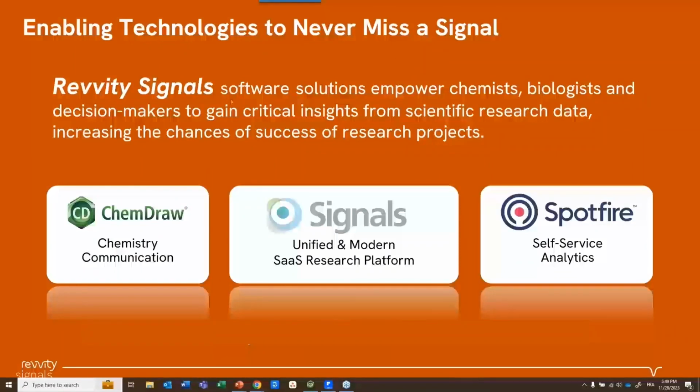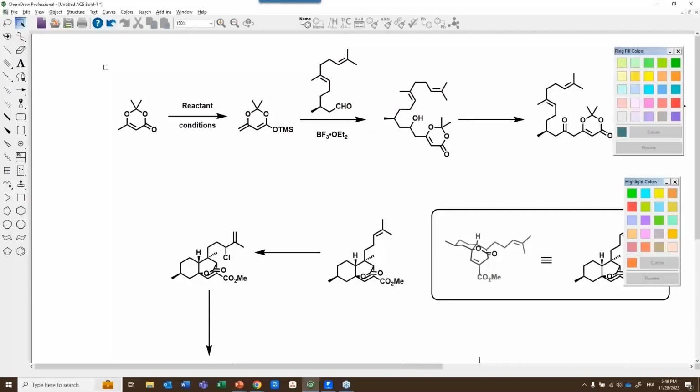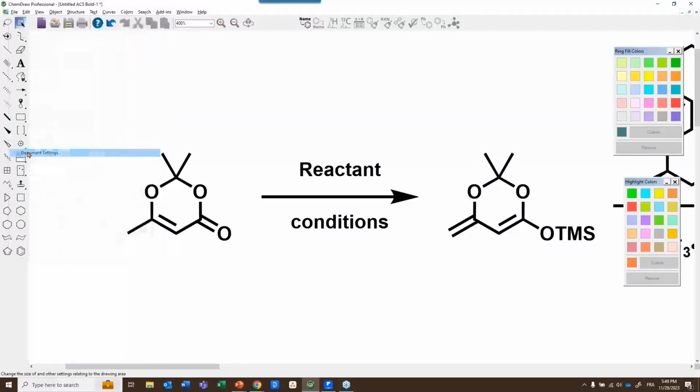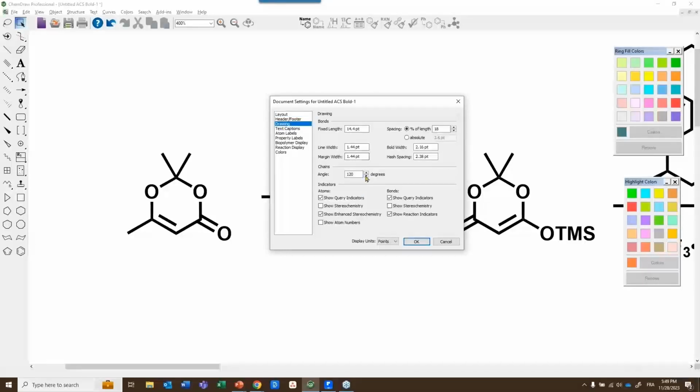So there's one, for example, that is the document settings that I'm using, which is a very good point. I could have started with that. The document settings that I am using, I may do another Connect just on that. You go to document settings, and in the drawing, so it's in points here.